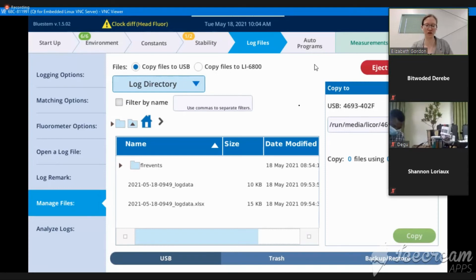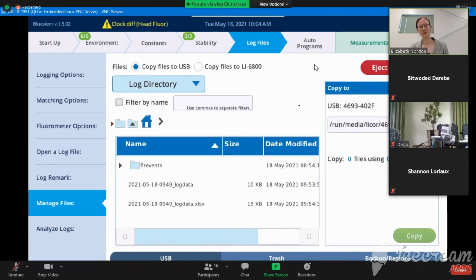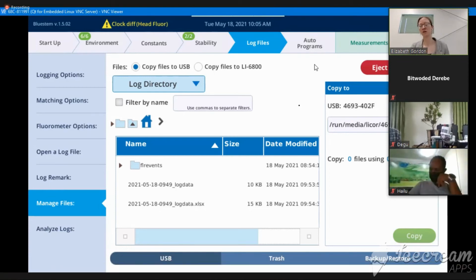And we will also configure your instrument to match if. We haven't really talked about match criteria very much, but what we want to do is tell our instrument that it decides when we match. We talked yesterday about what matching is and why matching is important. And in a lot of cases, to make sure that we match when we should, it works well to have the instrument decide if we need to match. That way we don't match when we don't need to, and we do match when we do need to.